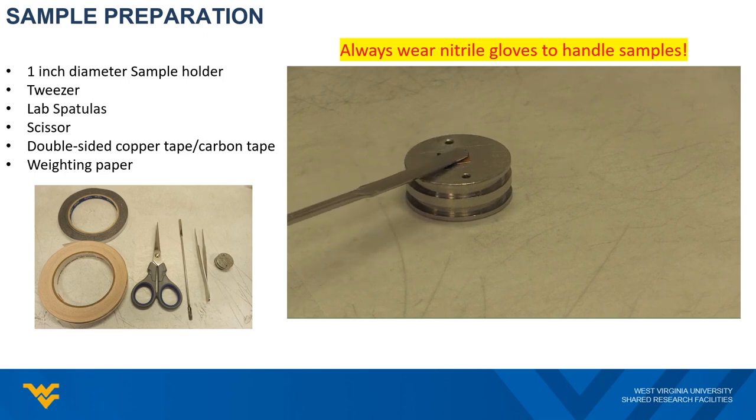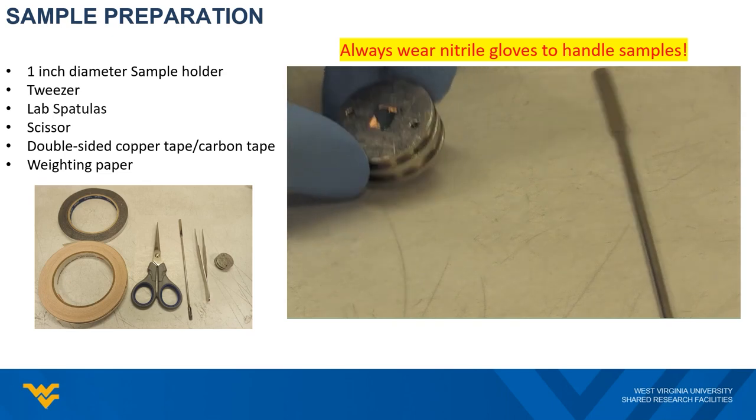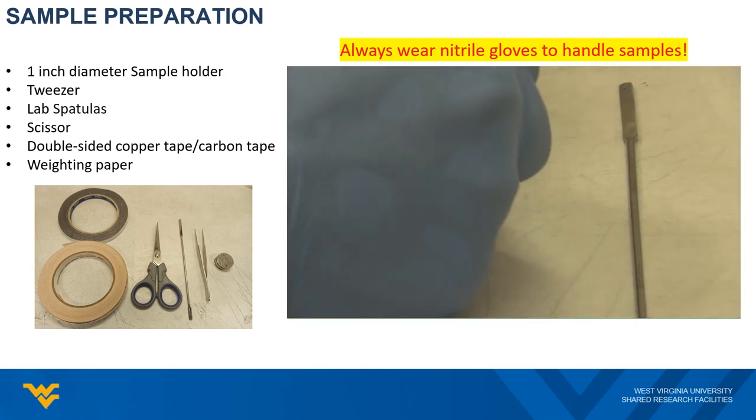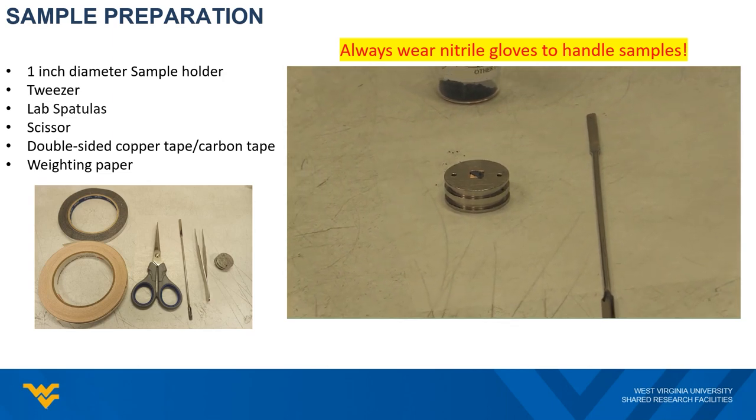Then firmly press on top of the sample to make a smooth and flat surface. After that, you need to remove all loose powders by shaking the holder at an angle. And now you have your sample ready.